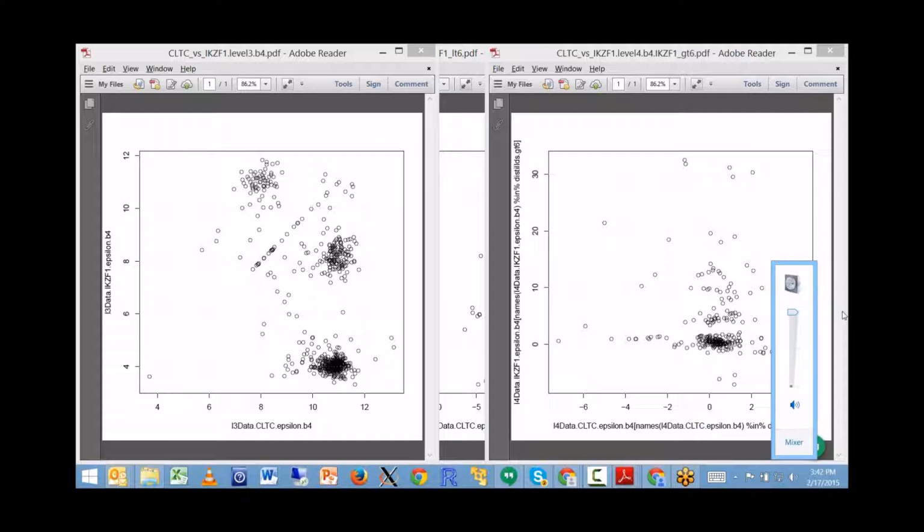I don't have a very good idea at this point, but maybe going through these baseline measurements that we know, and then looking at clusters that show up like this in level 3 data, and how they finally translate into these level 4 z-scores, would give us some idea of which expression levels are reliable and which are not.